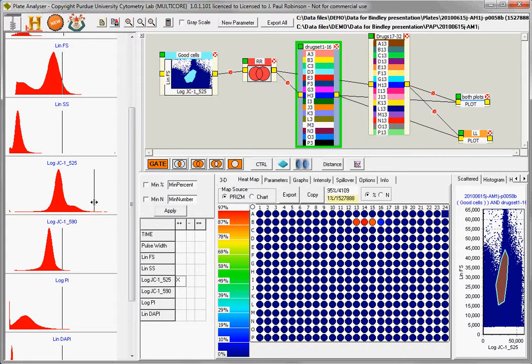And if you move this over here, well, clearly virtually no cells are there, although there's this cell here. These two have some kind of very, very high fluorescence. But now you can see a pretty nice pattern emerging, because these high concentrations of drugs are followed by dose responses here. High concentration of drugs, dose responses.